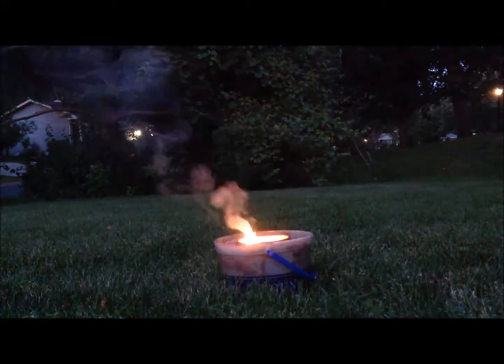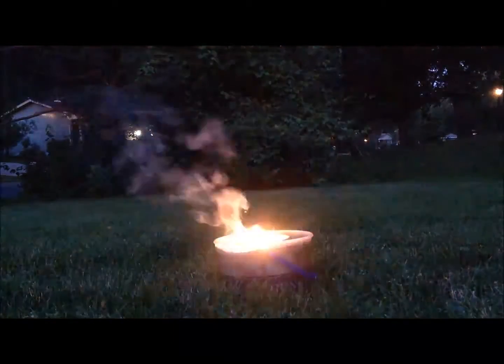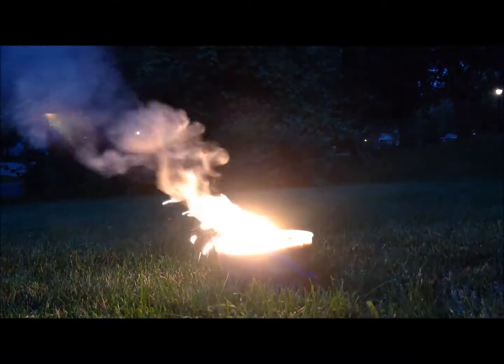Manganese thermite should be very energetic, so much so that it actually boils off most of the manganese metal produced. As you can see, this batch, well pretty, is missing something.